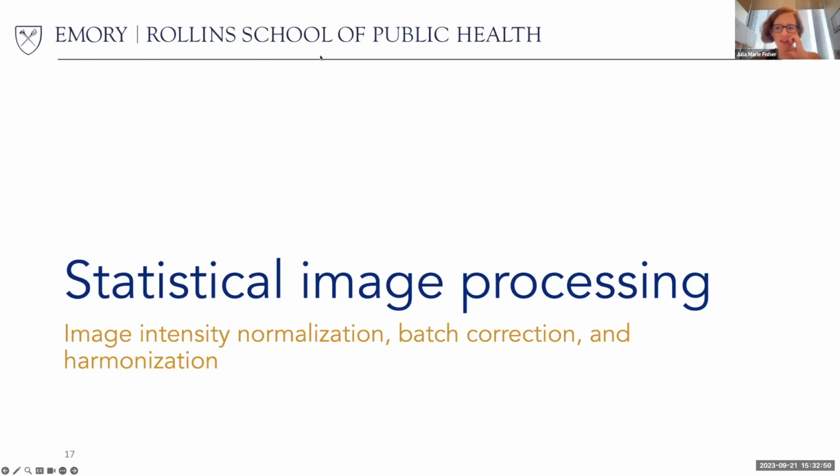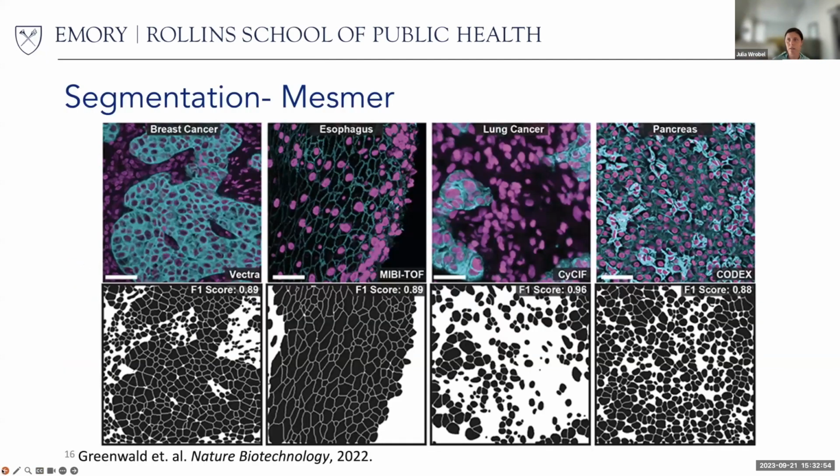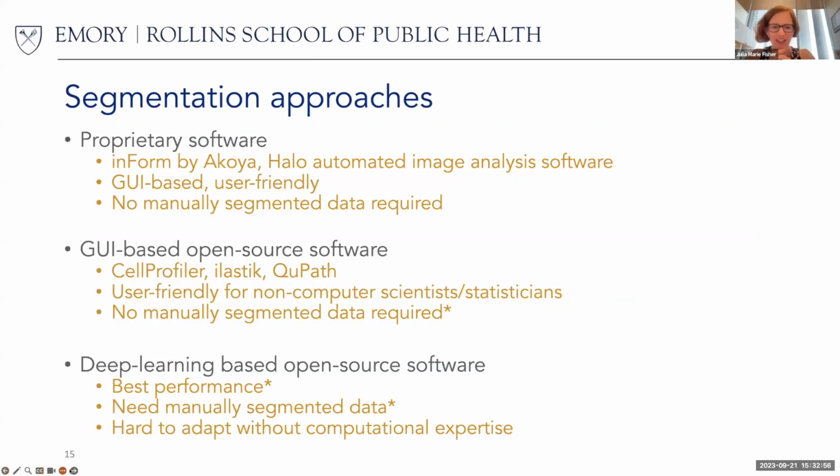I just wondered about the manual work. Oh, I'm sorry. Yeah, TM. Oh yeah, the manual. That's very good. Well, I'll ask my question, sorry. So that manual segmentation, especially if you were trying to train up a deep learning algorithm, how long does it take to manually segment an image? How much manual labor is it? Really, really painful.